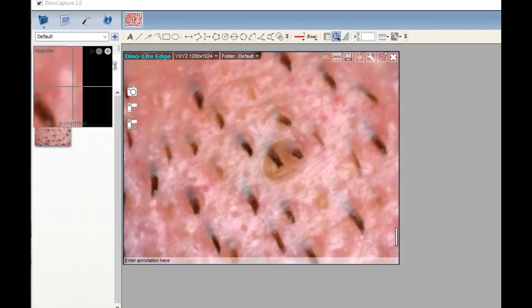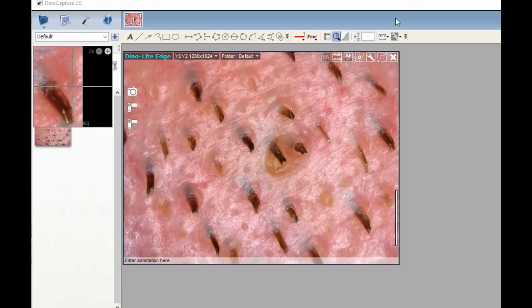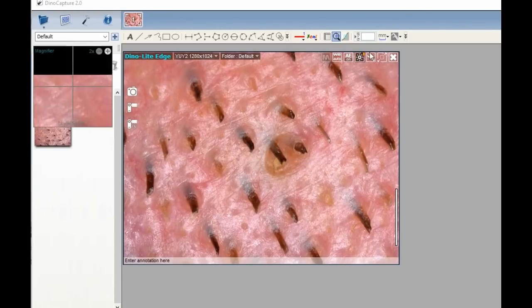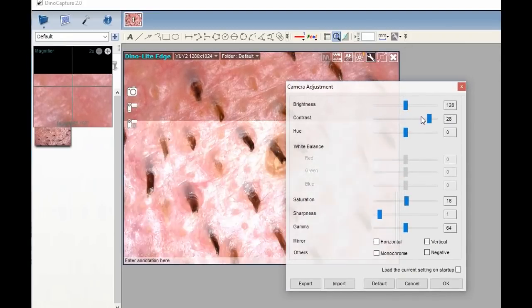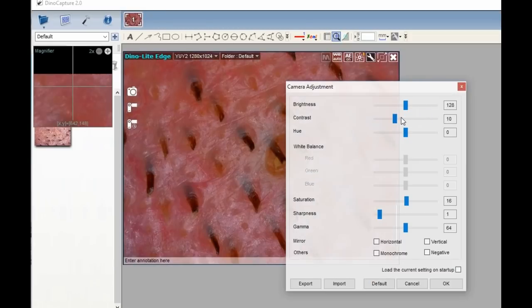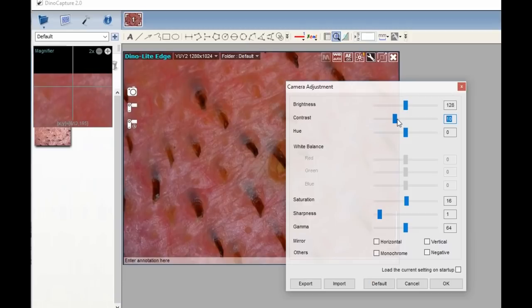Let's look at the software that actually comes with it — the DynoLite 2.0 software. It's pretty easy, plug and play, installs with CD or it's available on their website. You click the record button to record and you've got some settings here to adjust the brightness, contrast, and a little bit of the hue and saturation. Most of them are pretty much set to where you're not going to have to mess with it.